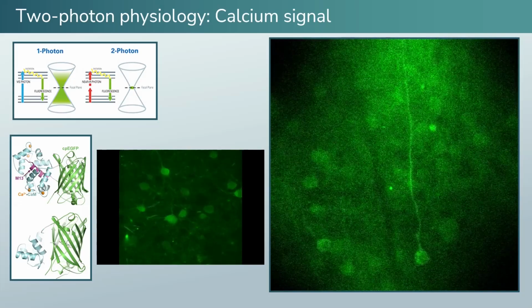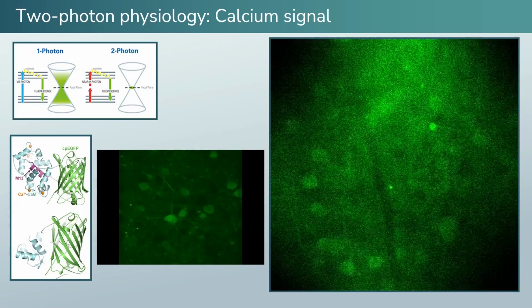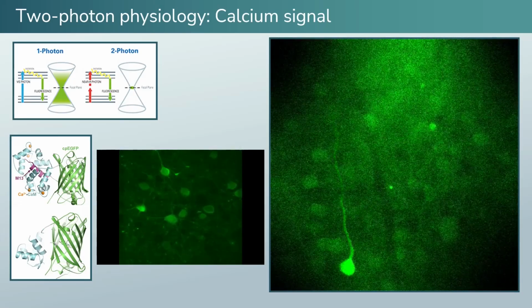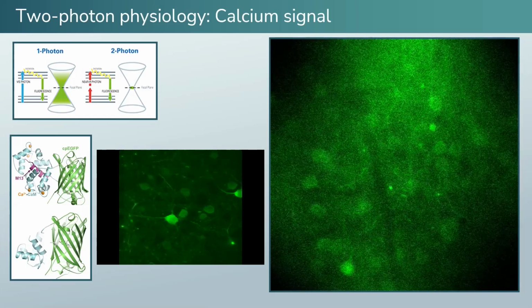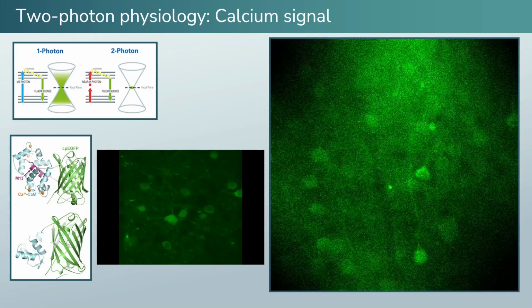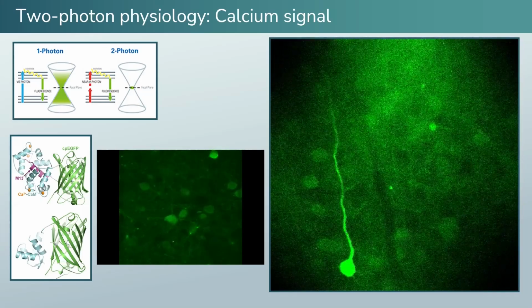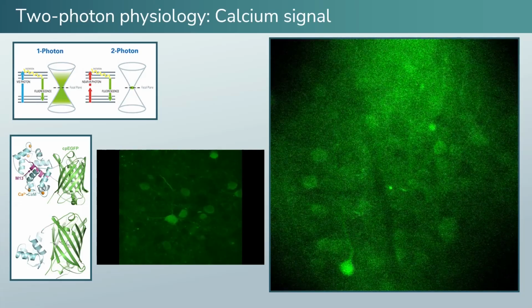The recordings are spatially detailed. You do see the cell bodies lining up, but also thin processes like dendrites down to the level of dendritic spines that have a diameter of roughly 1 micron. These recordings were done in the visual cortex of awake mice during behavior.